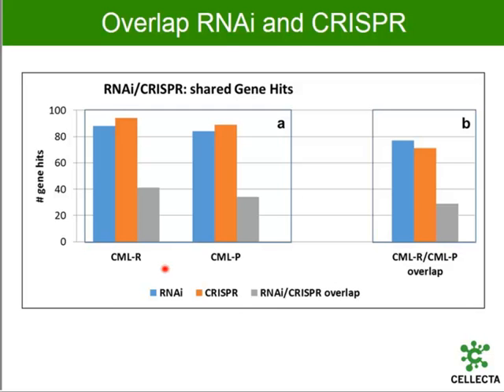To do that sort of analysis, you don't want to just look at the very strong ones, the ones that show up in a strong selection in one screen and just miss the mark in the other. That's not really the approach. The approach is to look at the ones that show up in one screen, say the shRNA screen, but that you can't find in the sgRNA screen, where the sgRNAs targeting that gene really don't give any signal at all.